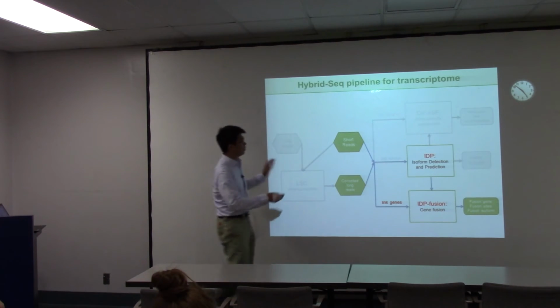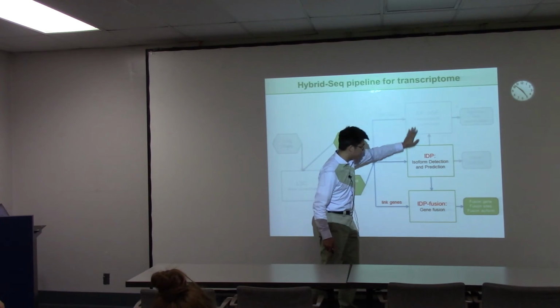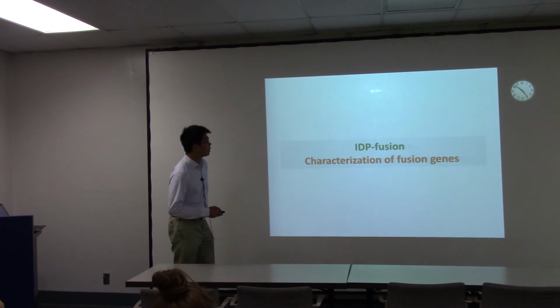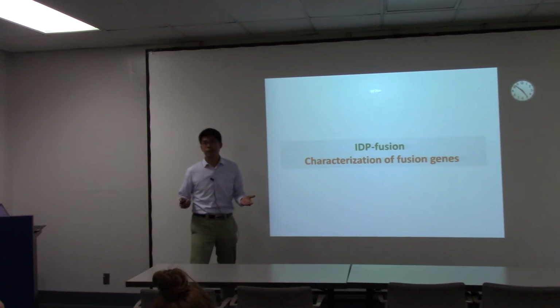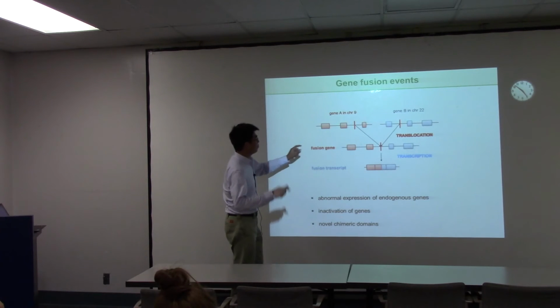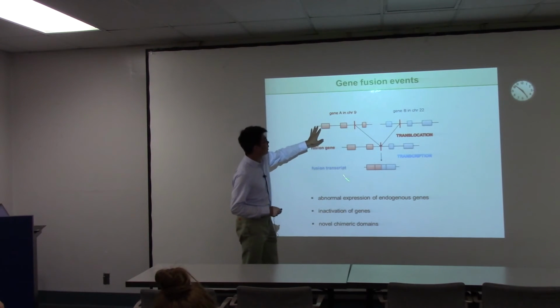Okay, I showed you some very interesting results from IDP-ASE. At last, I want to show you what we find from the fusion gene. I think, are you familiar with fusion genes? Okay, fusion genes are like this.